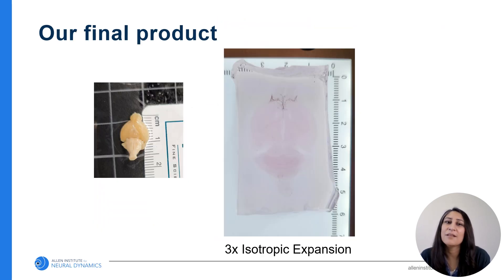Here's an example of what we want to achieve: an intact mouse brain where the neurons and their fine axonal projections have been sparsely and brightly labeled brain-wide, and the tissue has been cleared and expanded so that we can image deep inside the tissue and achieve the resolution needed to visualize those fine structures.